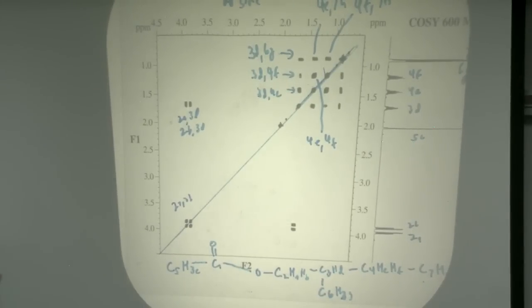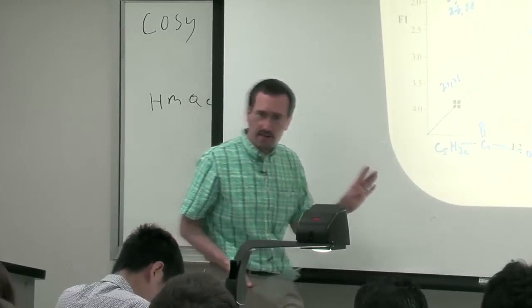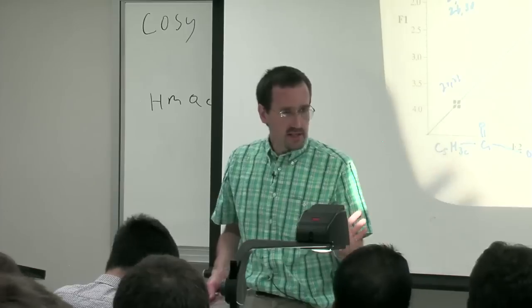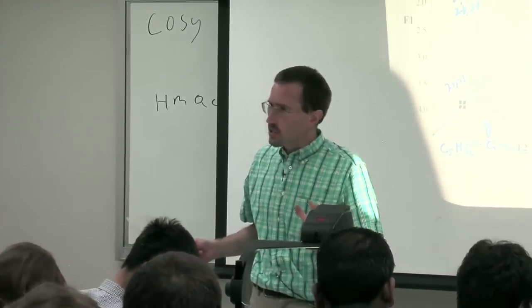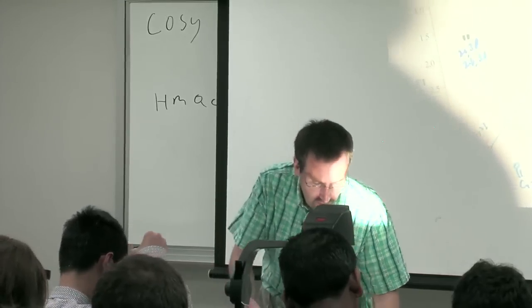Obviously, it's not as easy the first time around as I make it look here. But the same strategy, we'll start with a simple problem set next week. The same strategy of going ahead and working the HMQC and then working the COSY is going to take you very far.